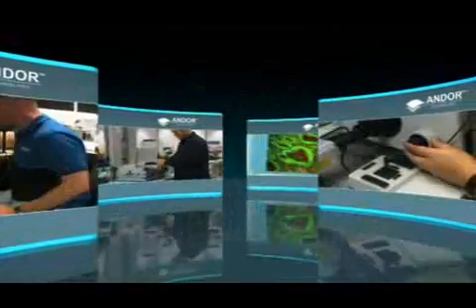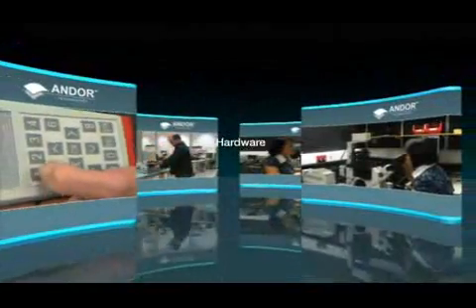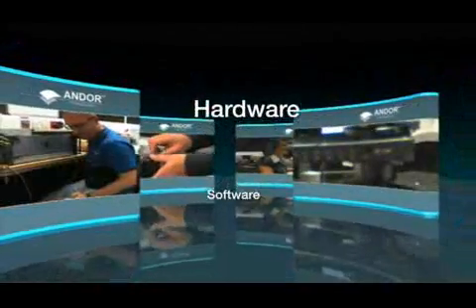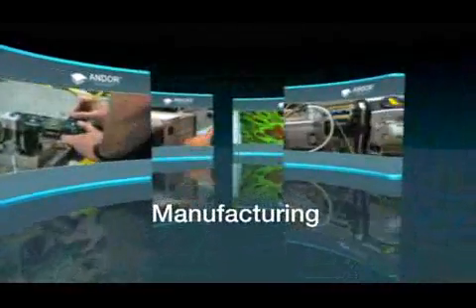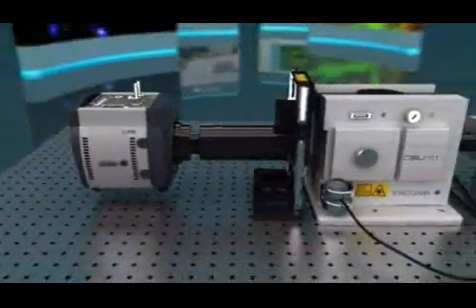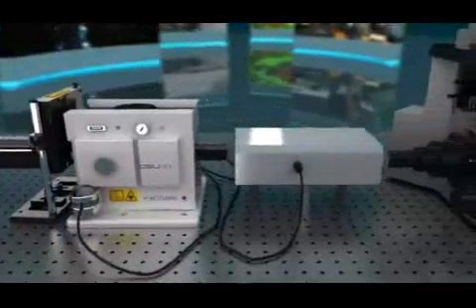Revolution products express a unique blend of hardware and software design, innovation and manufacturing skills. Our aim is to deliver a robust leading edge solution and a positive buying and ownership experience.